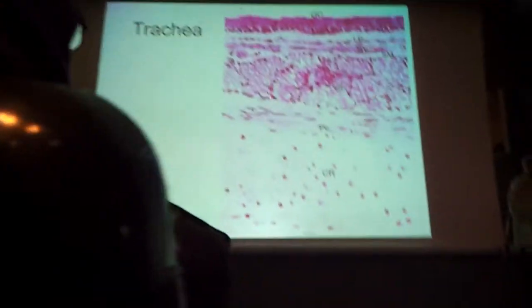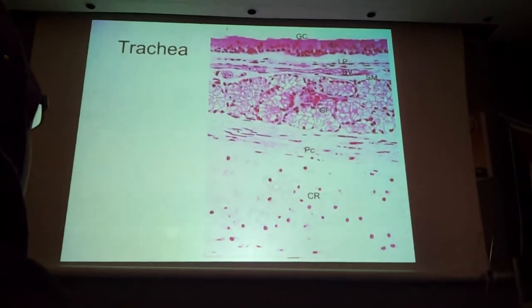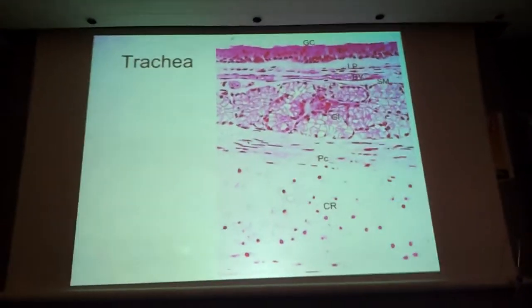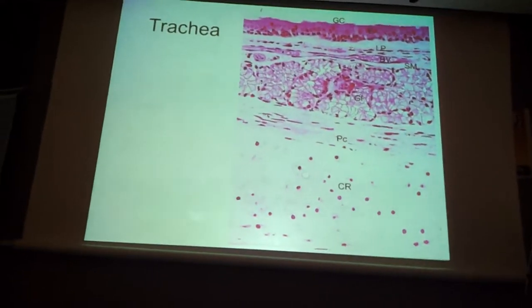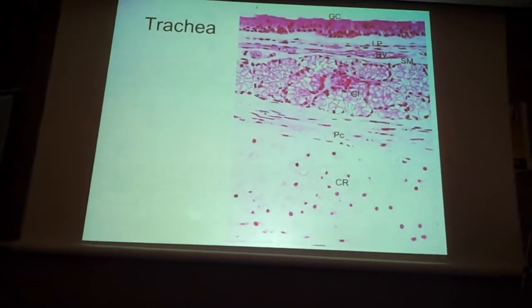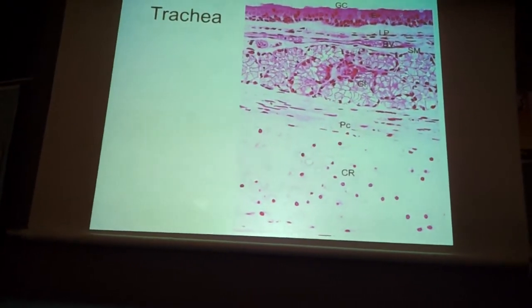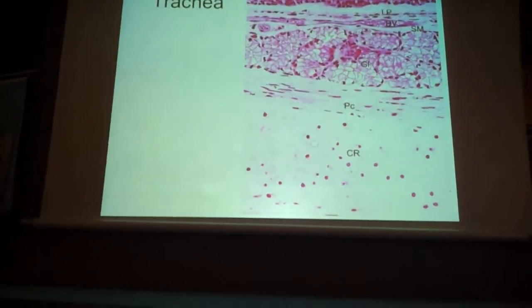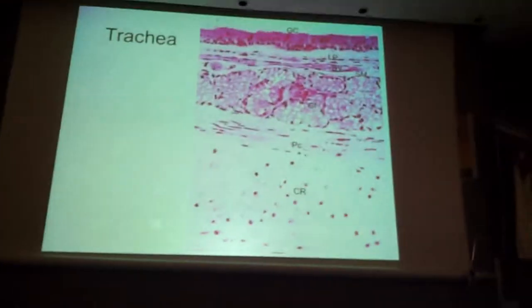We will go over views of some sections or areas of the respiratory system. To start with, there is a trachea. This is a section showing the wall of the trachea. As you know, the trachea is relatively big, so it would be difficult to have a view of the lumen.